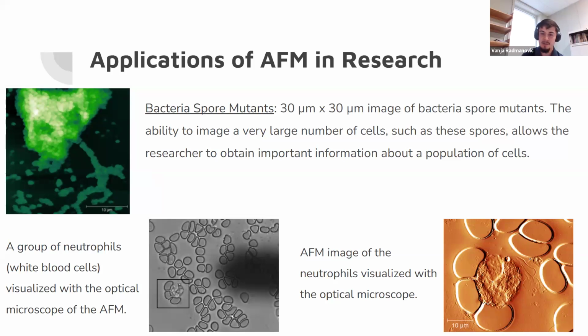And then on the bottom, these two images are very interesting, even though they didn't come from me using the AFM, they were kind of very similar. Because in the bottom middle image, you can see that the first image actually comes from an optical microscope, where they're kind of getting a bigger picture of what's on the sample. And that kind of shadowy figure to the right in the middle image is the actual probe, the cantilever tip. And then once you select an area that you want to image with the optical microscope, like for example, in the middle picture, they have a black box in the middle left.